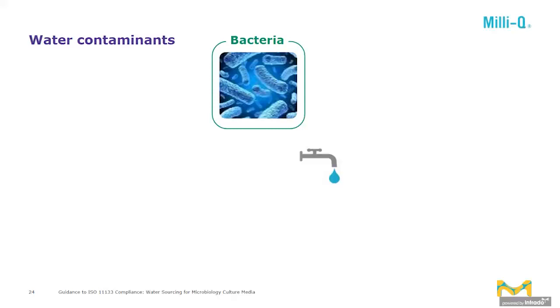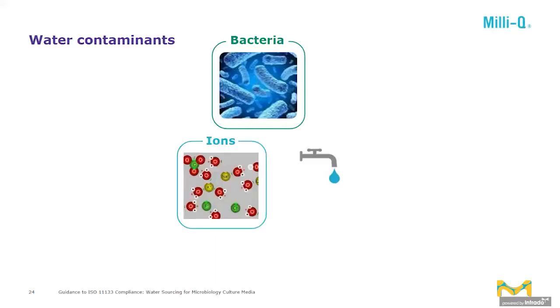Normally in tap water, there should not be too many bacteria because they're controlled by chlorination or ozonation. But of course, our tap water is far from sterile and it does contain some bacteria that are not dangerous for us to drink, but that may have an impact on your media and on your experiments in the lab.